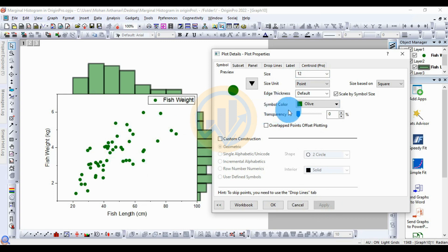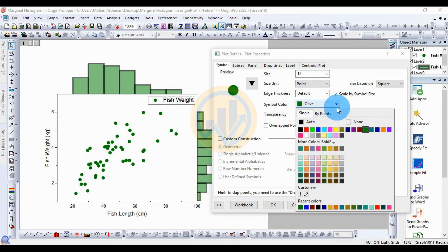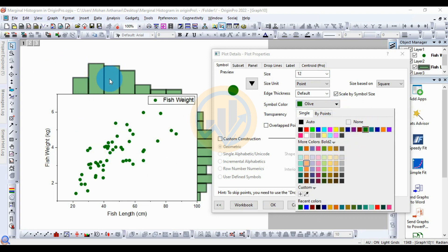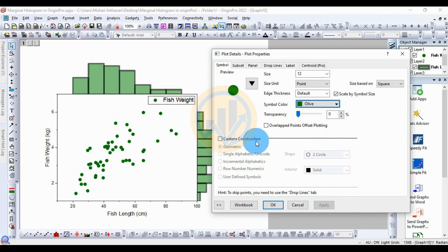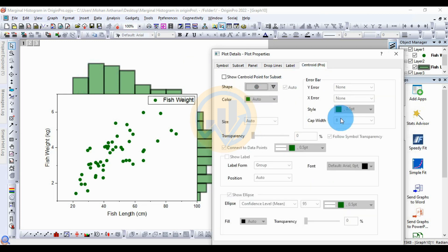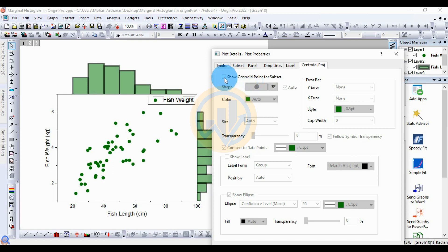For the color option, choose Single Color and select olive to match the histogram color. Next, for the Centering option, there is a checkbox. Click the checkbox to center the data points in the scatter plot.